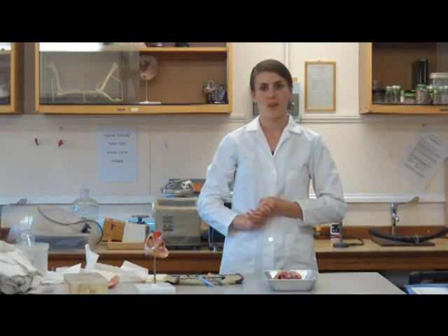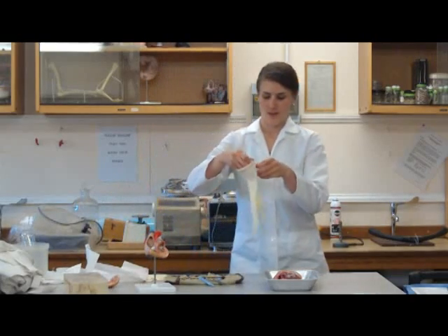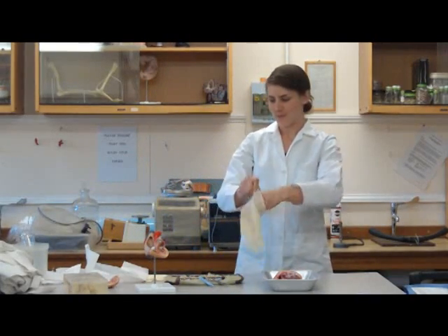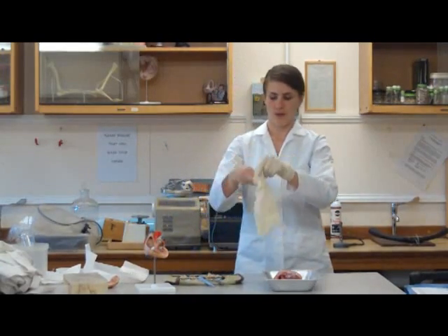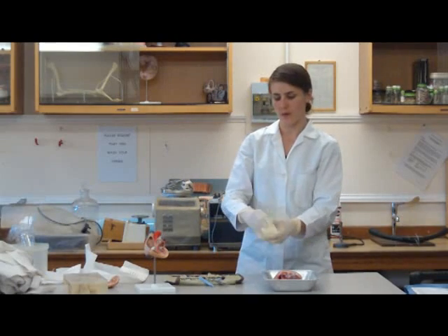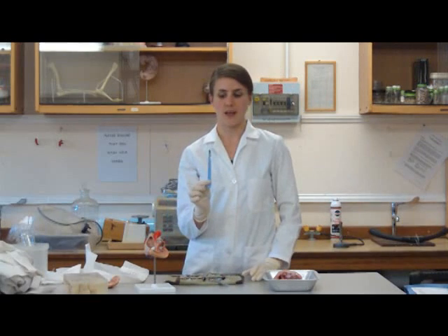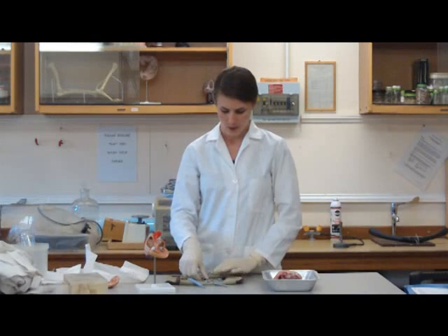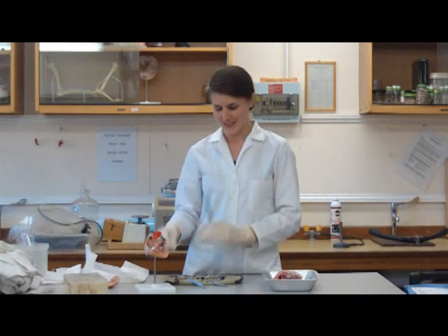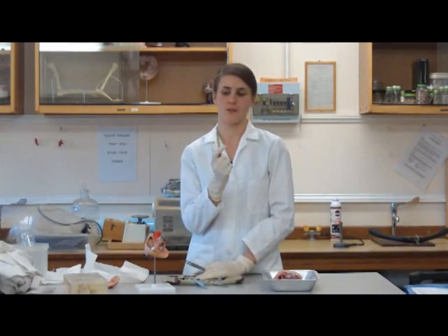We're actually going to make a start on the actual dissection of the heart. First of all, we need to put our gloves on. We already have the lab coat on and we need to make sure we've got the equipment in front of us. The main bits of equipment we're going to be using out of this dissecting kit are a scalpel, some scissors, possibly some tweezers, and a mounted needle as well.